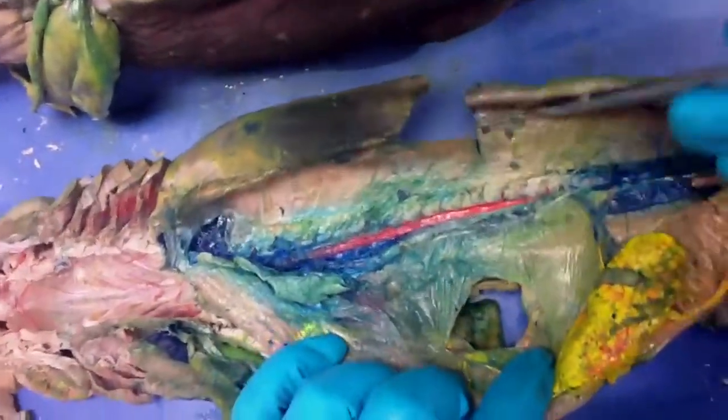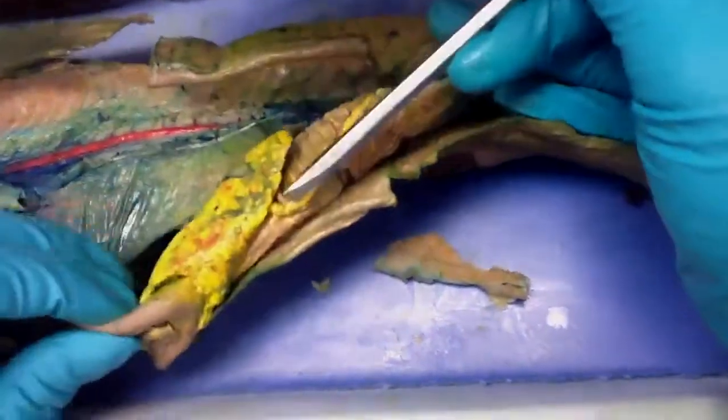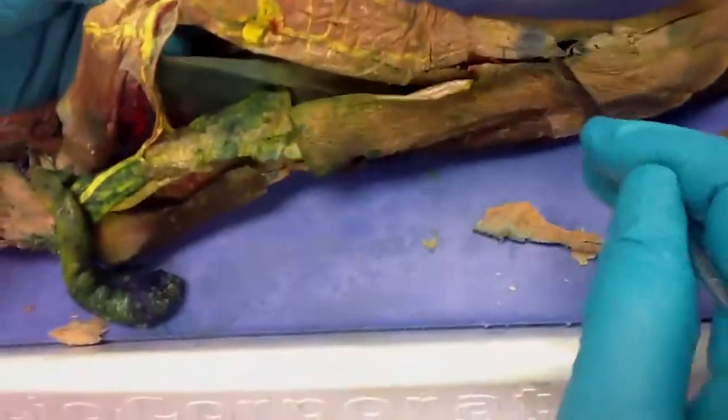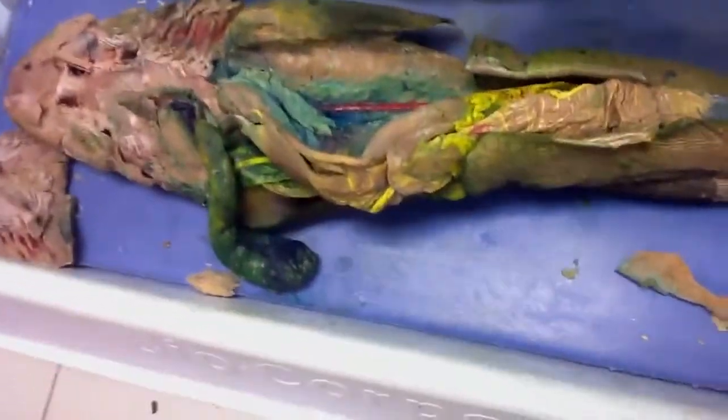We did go through this a little bit. Yeah. We have the dorsal aorta, and then the posterior mesenteric artery that comes and supplies, and then we get all the blood supply through the rest of the system. And that is the circulatory system for the shark.